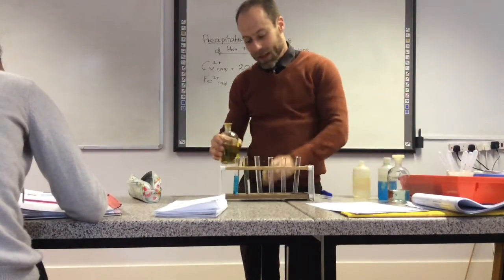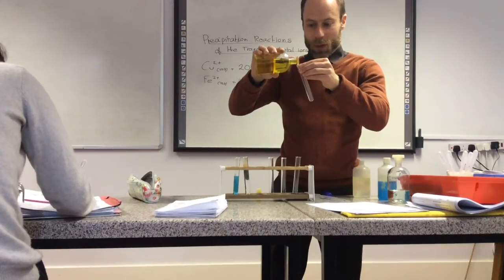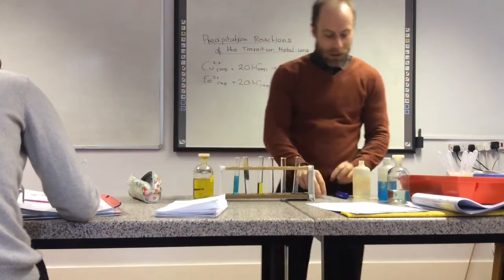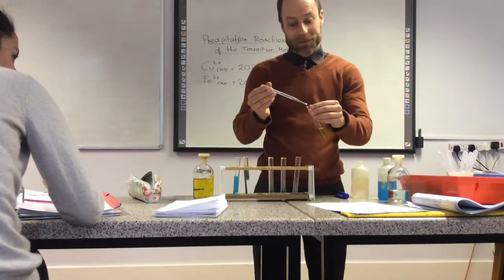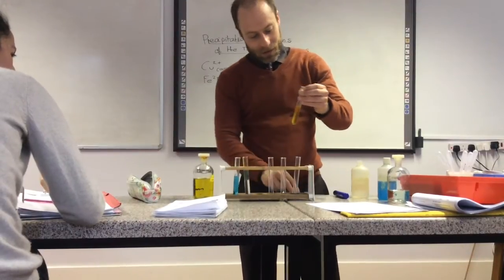This is quite a white colour. So what are we expecting to see this time? Is this the orange, rusty one? Yeah, this is the rusty one. Oh, is this what we did last lesson? Yeah. Orange.